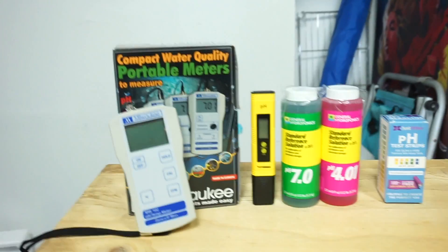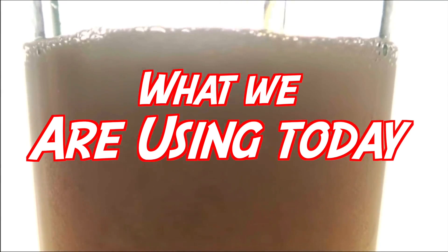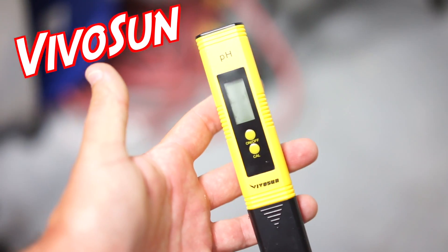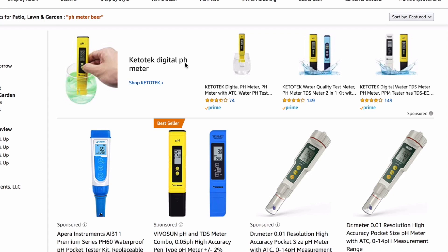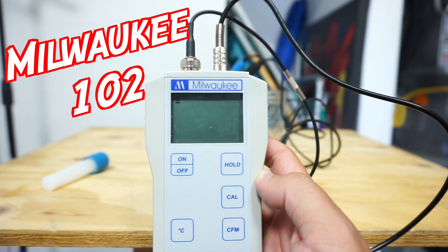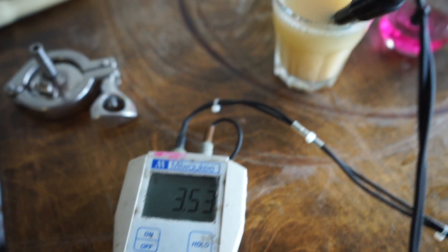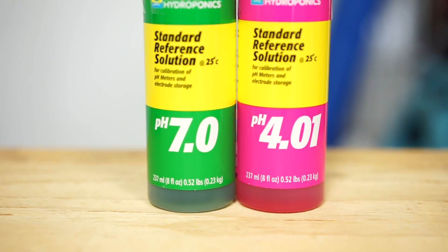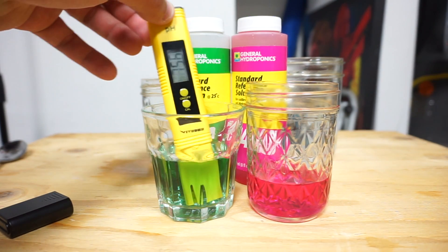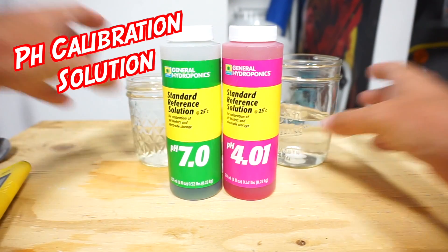Today is about what pH meter we plan on going with, because they can range anywhere from about $10 to $300. We'll be using three things. The VivoSun pH meter — it's the Amazon bestseller, four stars with almost 1,400 reviews. It also comes with a parts-per-million meter, which is good for growing weed but doesn't help with beer. 23 bucks on Amazon Prime. We're also going to be using the Milwaukee 102 pH meter — we've used this in the past and it's always calibrated spot on. For pH calibration solution, you're always going to want to use two of these — never calibrate with just one. I vouch for General Hydroponics, it's maybe eight or nine bucks each.